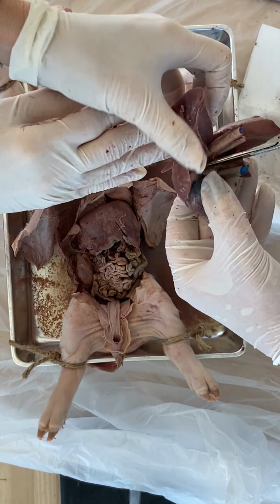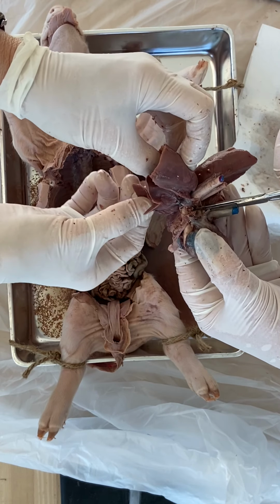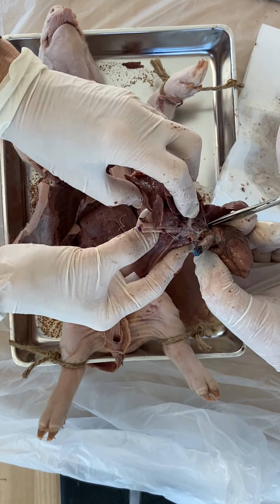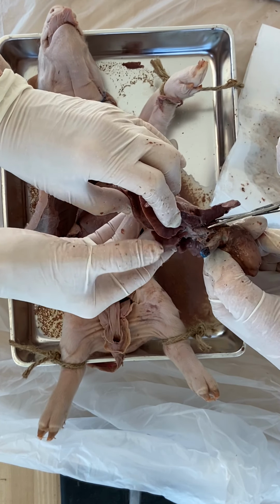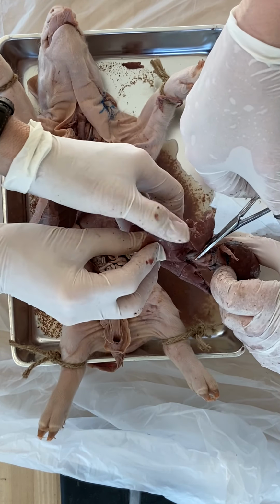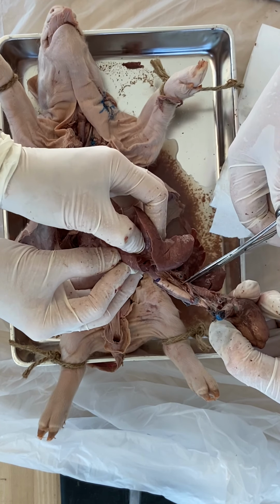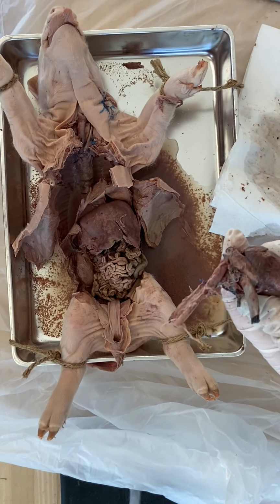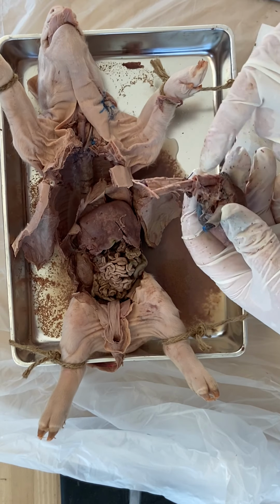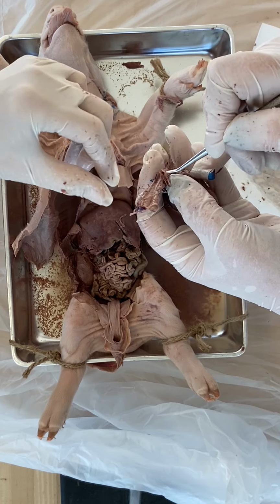With all the tissue, it really is hard to... I'm trying to not cut through major vessels so that at least we can see. Pulmonary. There you go. And you got your trachea. All right, here's the trachea. Can you see the ridges? There you go. That's the division, yes? Is that the division there for the bronchi?